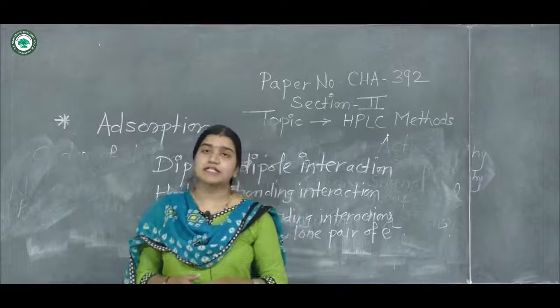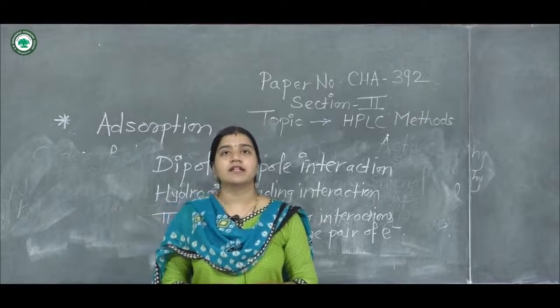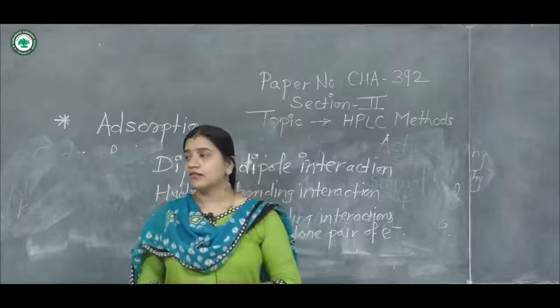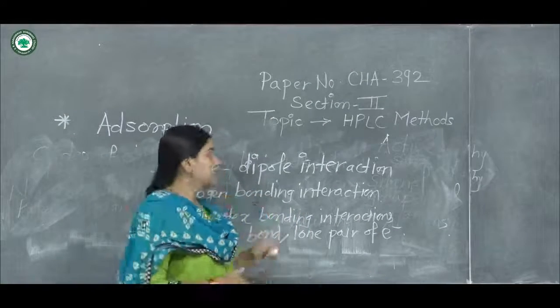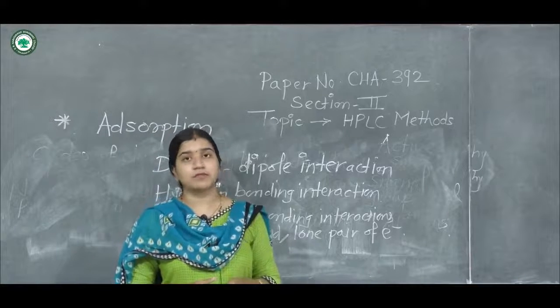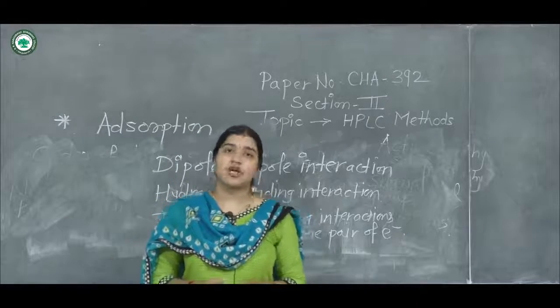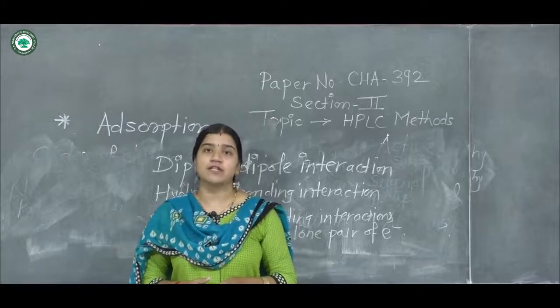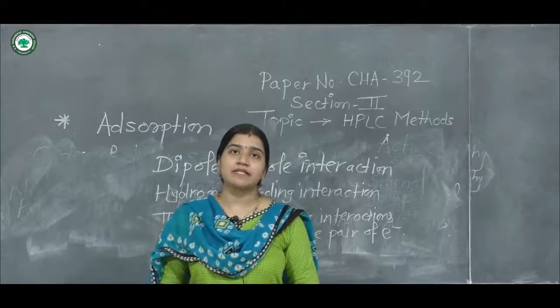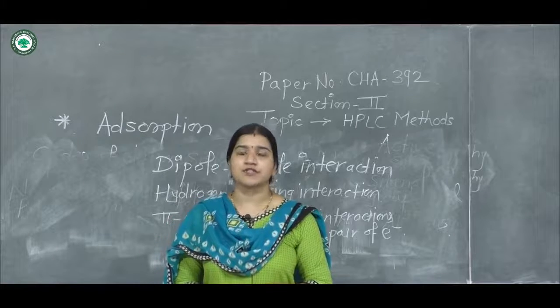So this is our today's discussion related to adsorption chromatography, the interactions between the adsorbate and the adsorbent, and along with that the number of interactions that take place during the adsorbate-adsorbent interaction. Adsorption chromatography is nothing but normal phase HPLC. After this we will discuss the eluotropic series and the remaining part of this topic in the next lecture. Thank you.